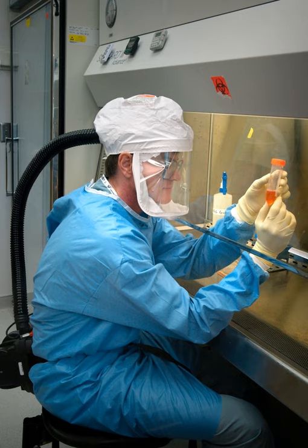even when exhausted with a thimble or canopy to avoid disturbing internal airflow. The Type A2 cabinet, formerly designated A/B3, has a minimum inflow velocity of 100 feet per minute. A negative air pressure plenum surrounds all contaminated positive pressure plenums. In other respects, the specifications are identical to those of a Type A1 cabinet.